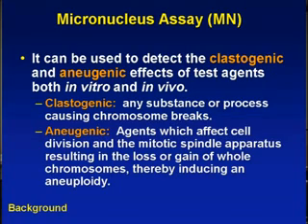agent. This could be anything, because for instance, if you have a new compound or you want to seek any kind of FDA approval, probably you have to do this type of analysis to prove that the agent is not toxic or does not cause any kind of mutation or carcinogenesis. In case you're not familiar with these two terms, if you're not in the toxicology program, clastogenic is any substance or process causing chromosome breaks. Certainly, radiation is one of the agents that can cause this clastogenic effect.